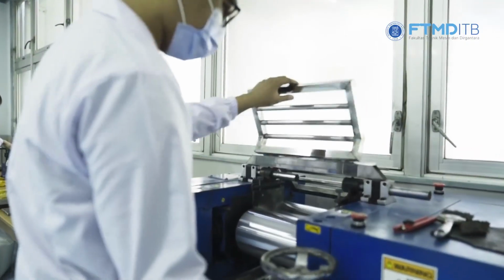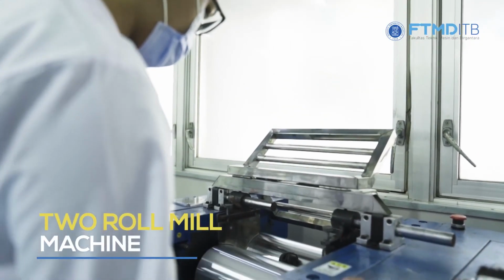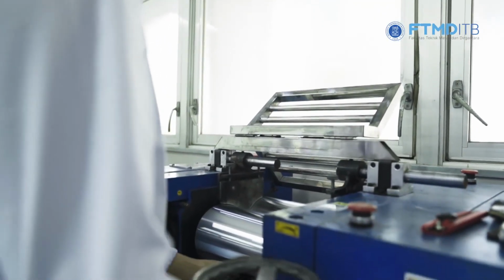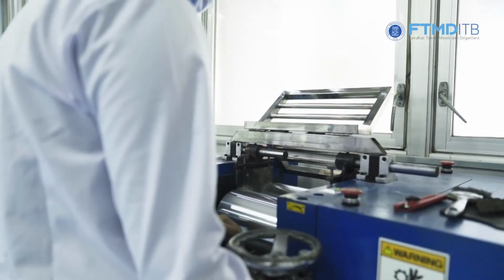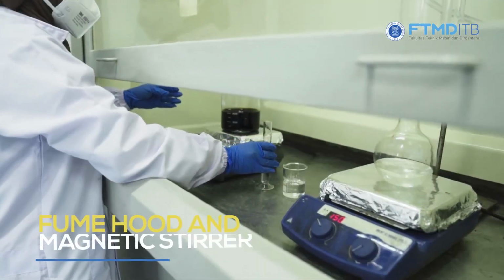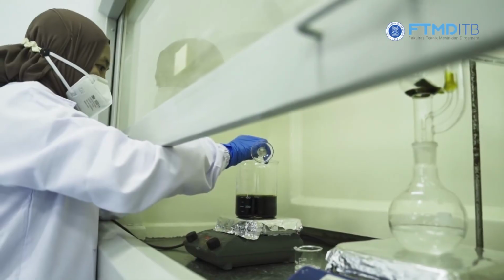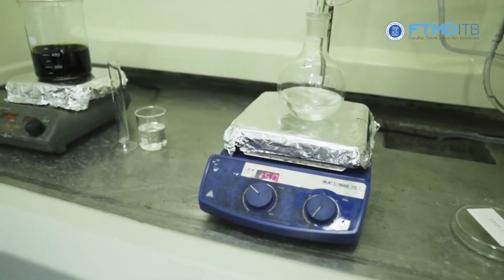To make a rubber compound, we use a two-roll mill machine. Here, we mix various chemicals to make different recipes, which are then vulcanized using a compression molding machine to make a sample test. I will show you our fume hood. This is where we do material extraction using this magnetic stirrer and Soxhlet. Also, we do reactions here using a volatile solvent.